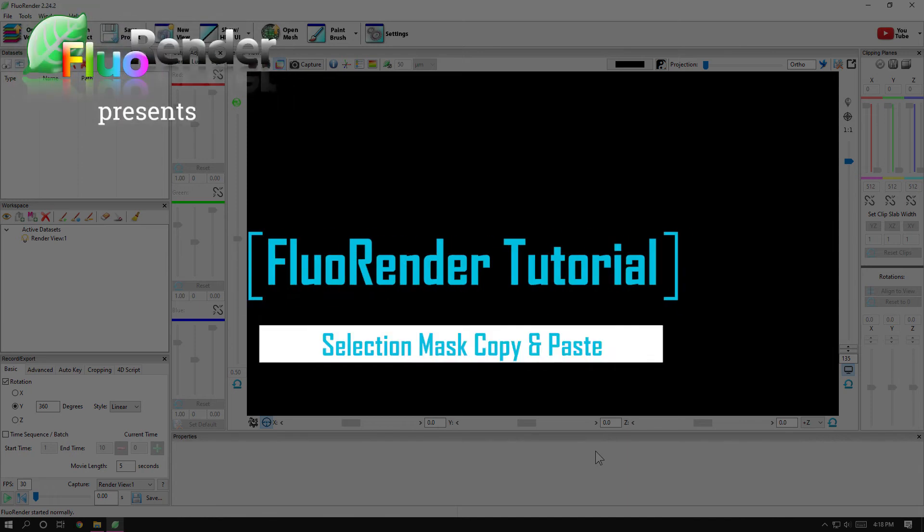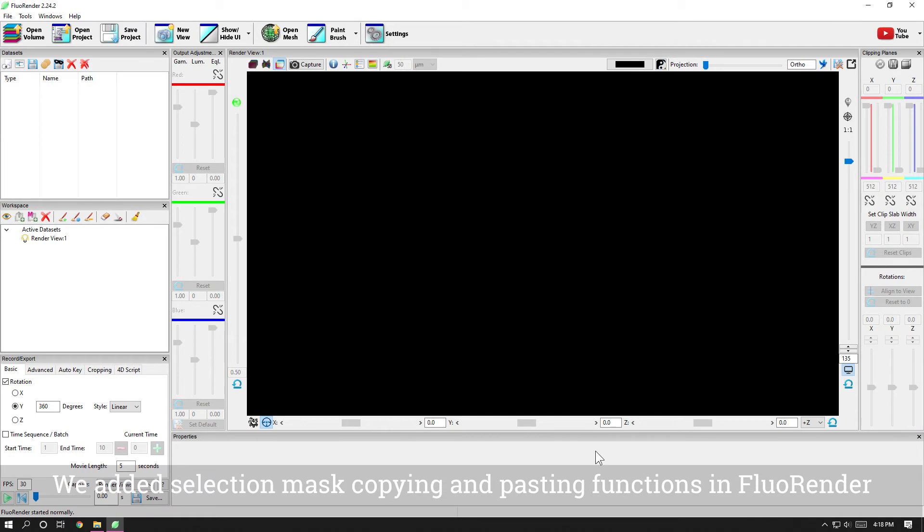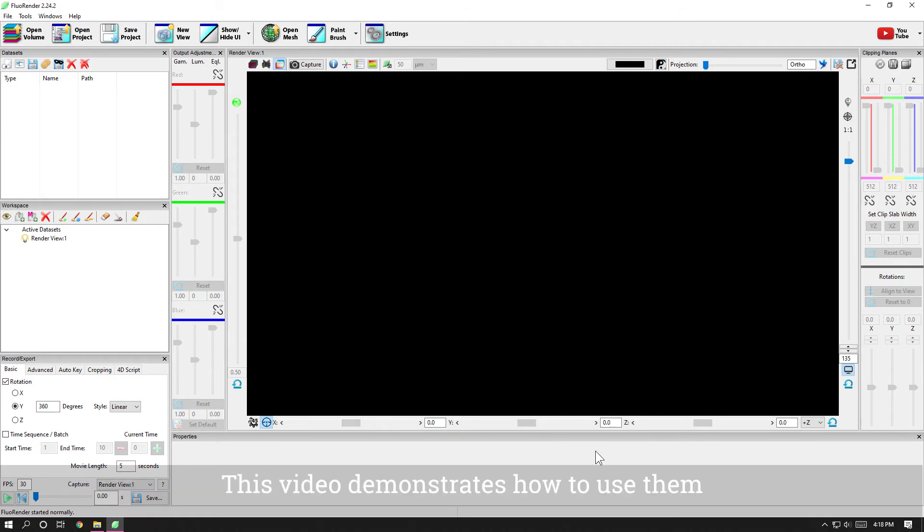Fluorender tutorial: selection mask copy and paste. We added selection mask copying and pasting functions in Fluorender. This video demonstrates how to use them.